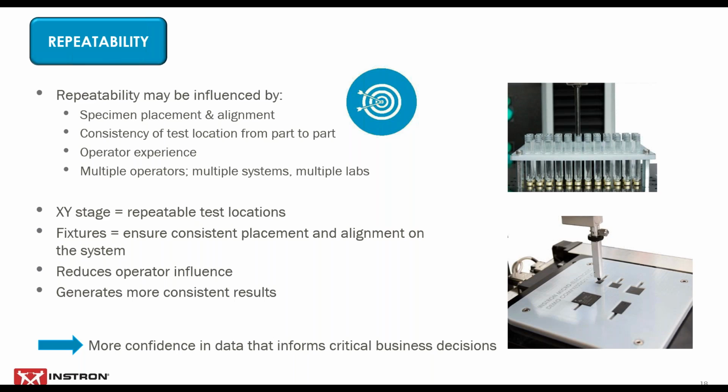This is compounded when testing multiple points on a component. The integrated chips shown in the photo here are small, ensuring that these parts are tested in the center and at the same 4 points around the edge is challenging when setting the specimens up manually.